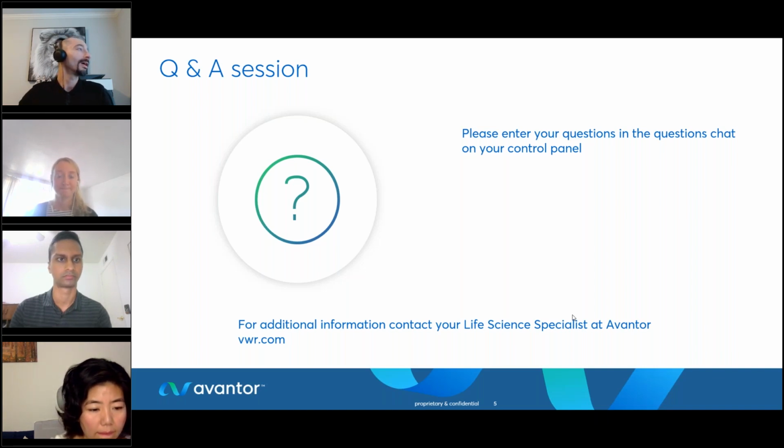Thank you. The next one's for you, Aaron. Could you talk through the difference between the previous and new chemistry, that is the RBK110 versus the 114 kits? Definitely. So the difference with the new chemistry is a different motor protein and pore chemistry.